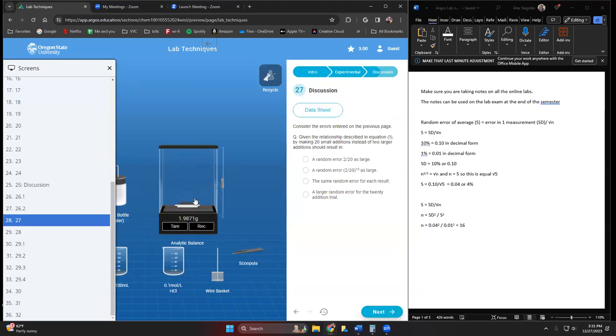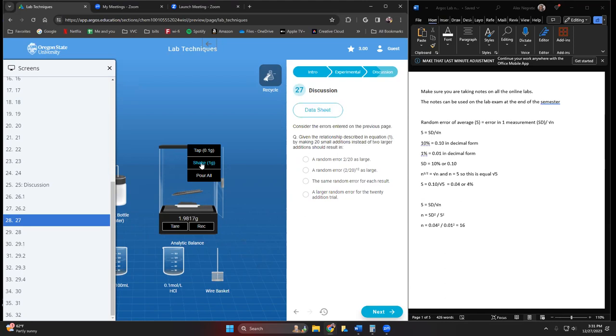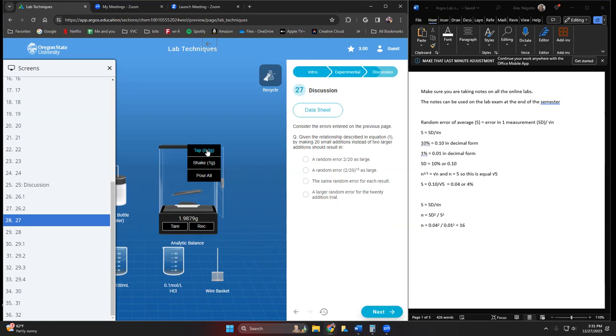You'll notice I can either tap at 0.1 gram or one gram. If I want two grams, I just need to tap this twice. If I want two grams with 0.1, I have to tap this 20 times, but what happens is there's a larger error with these larger shakes than the smaller ones.